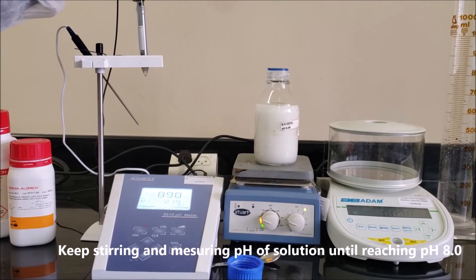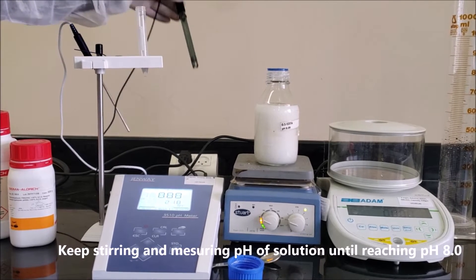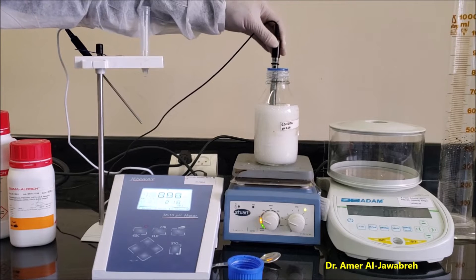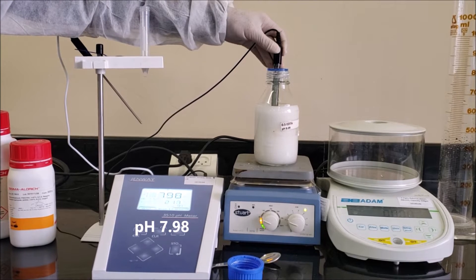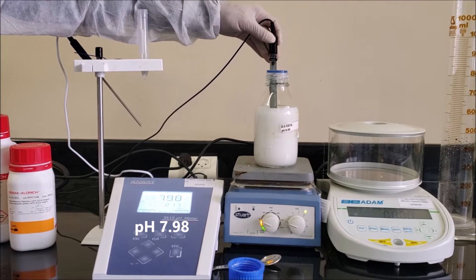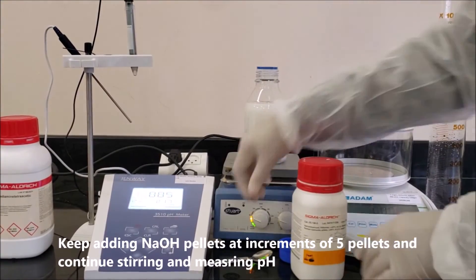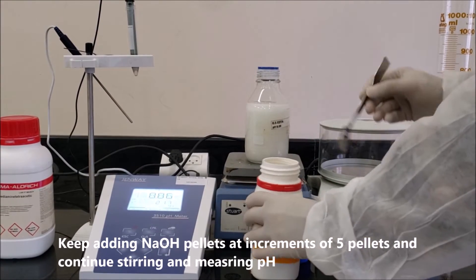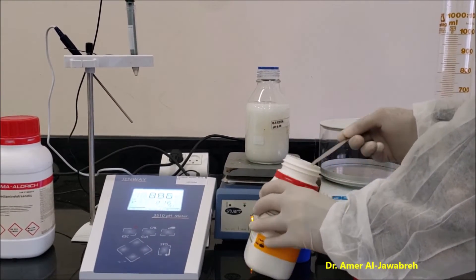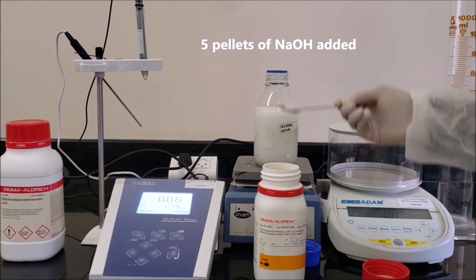Keep stirring and measuring the pH of the solution until reaching pH 8. Keep adding NaOH pellets in increments of 5 pellets, continuing to stir and measure pH. Add 5 pellets of NaOH at a time.